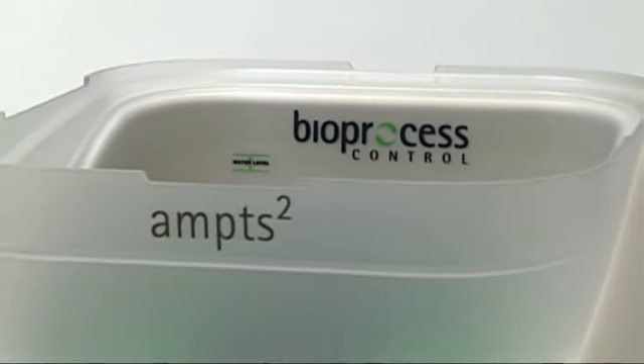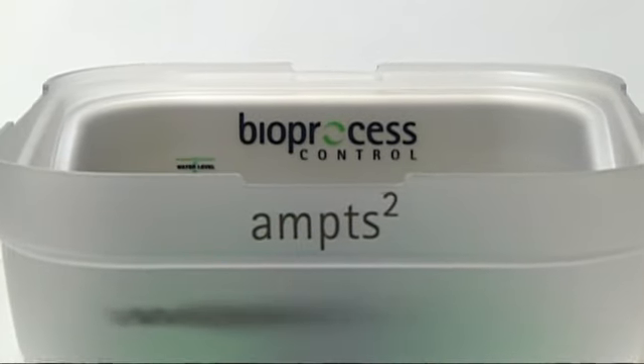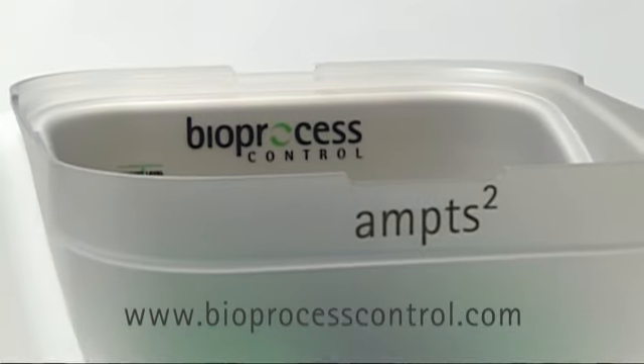As many others have done, discover for yourself the benefits of the AMPTS-2.